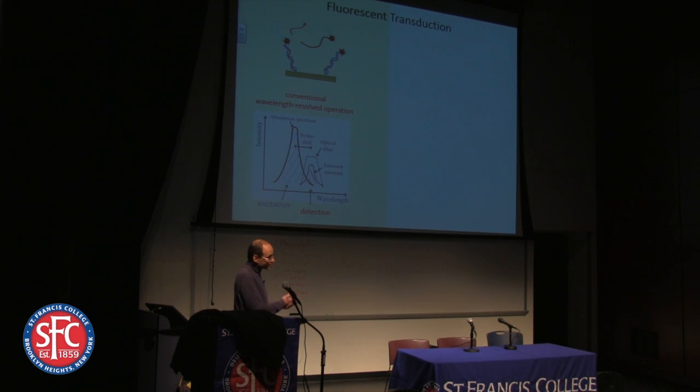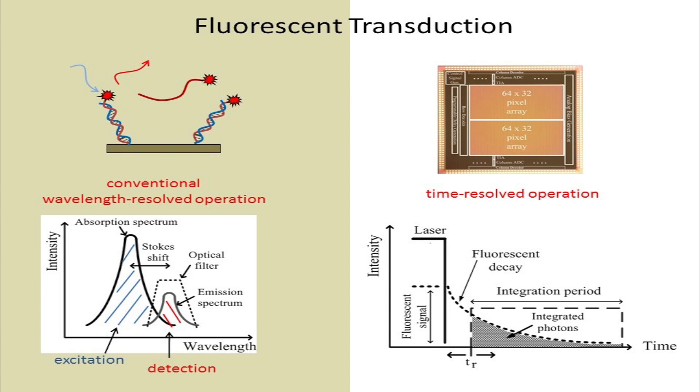Now, the laser part is a problem, because the laser is very, very bright, and you might have a tough time seeing the fluorescently emitted photons, which you're trying to detect, against all that background. So what's done in a commercial array scanner or fluorescence microscope, whatever you're using, is that they use optical filters, right? You put a filter that only transmits to the detector the photons of the wavelength that you want, and thus you block all the photons of the other wavelengths.